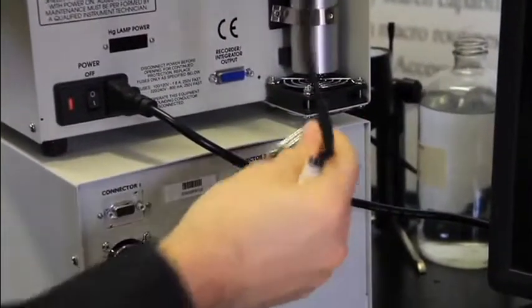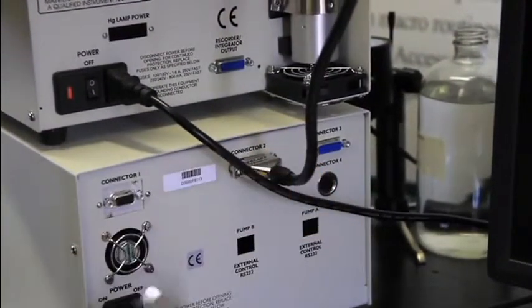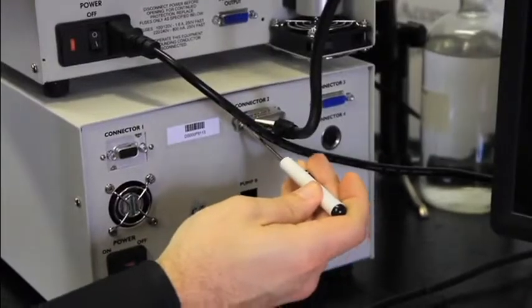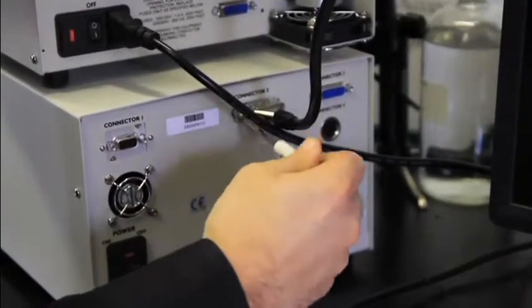The cord that is hardwired in the detector chassis on top goes into connector 2 on the pump chassis. All connections should be screwed in for optimal connection.